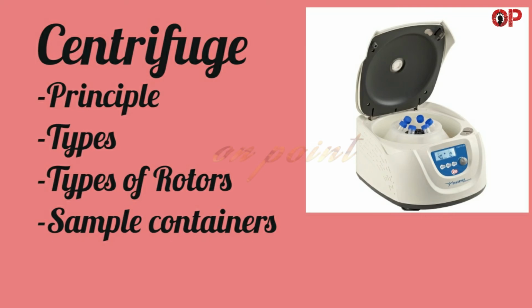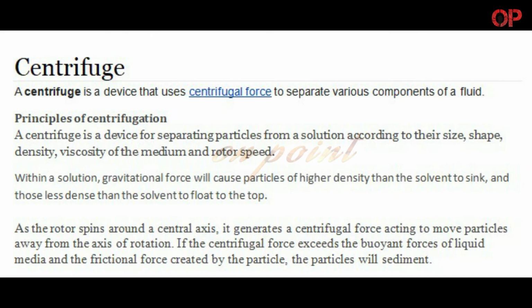In this video we are going to discuss centrifuge, so without any delay let's start the video. Centrifuge. A centrifuge is a device that uses centrifugal force to separate various components of a fluid.